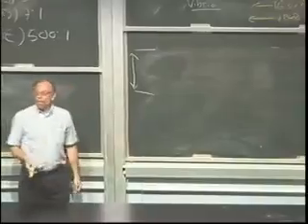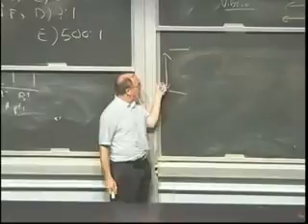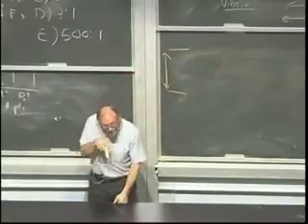Okay. Now, how many of you photographers use 35mm cameras? It's all digital, right? But in the past, I had a GSI say, oh no, you can't define depth of focus as a vertical distance. It's always the horizontal. And I said, just take that camera and switch it like this, and it becomes vertical. And that's what the microscope is doing. You're looking down. So depth of focus is vertical.